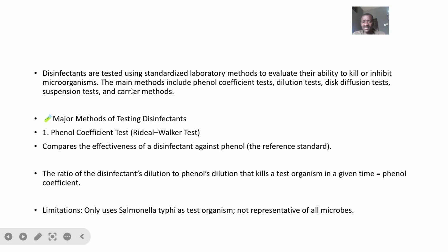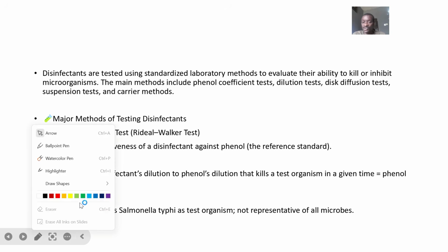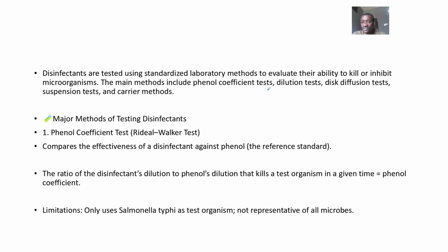We say that disinfectants are tested using standardized laboratory methods. Why are you testing them? This is because you want to evaluate their ability to kill and inhibit microorganisms. Okay, so you want to know how these things will actually function well. So the main methods are what we are going to talk about.